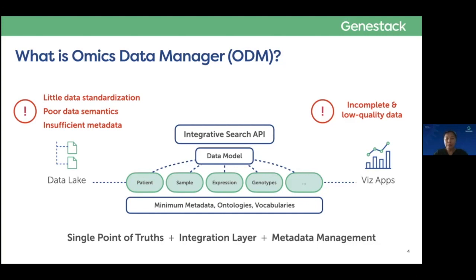ODM addresses this gap by providing a single point of truth to structure and standardize different data types, an integration layer to capture the relationships, as well as various tools to curate and validate metadata.